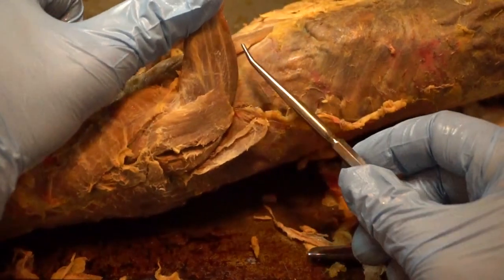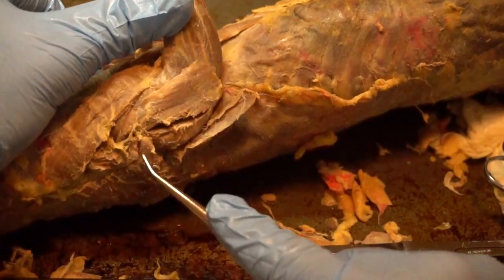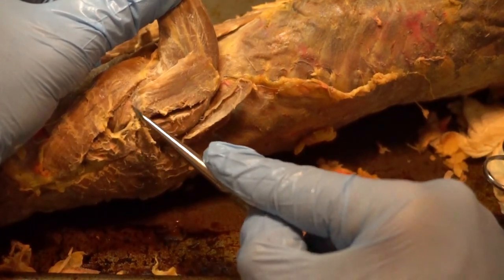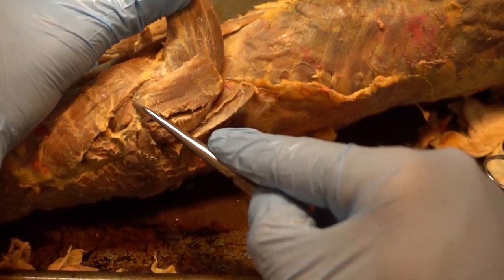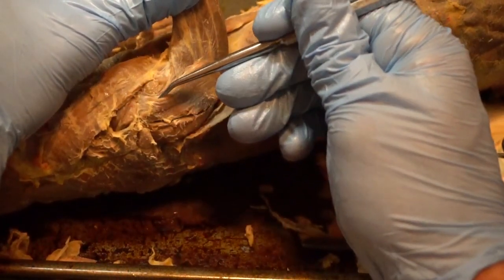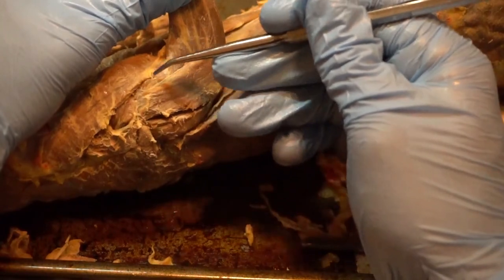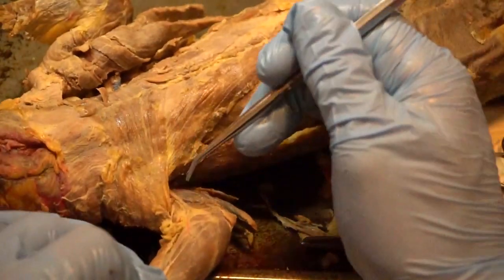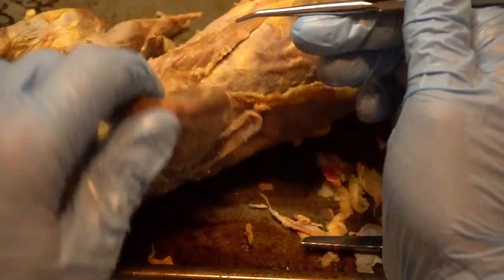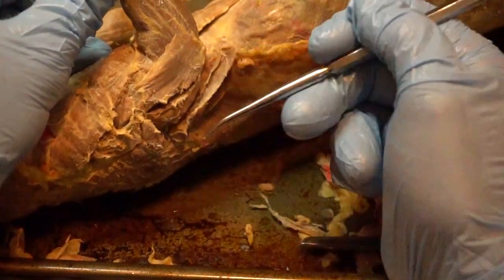There is one more muscle that's difficult to see — you really have to get a lot of fat out of the way. Here is your spinodeltoid, clavodeltoid, and acromiodeltoid just a little deeper. If you follow your acromiodeltoid down it comes to a triangle and the point ends about right here. Just past that and just underneath the lateral head of the triceps brachii you see another muscle — this is called your brachialis. Brachialis is on the lateral side — do not get this confused with the biceps brachii which is on the medial side. So brachialis is a little deeper, pretty much the same plane as the acromiodeltoid. That's all the muscles of the proximal arm.